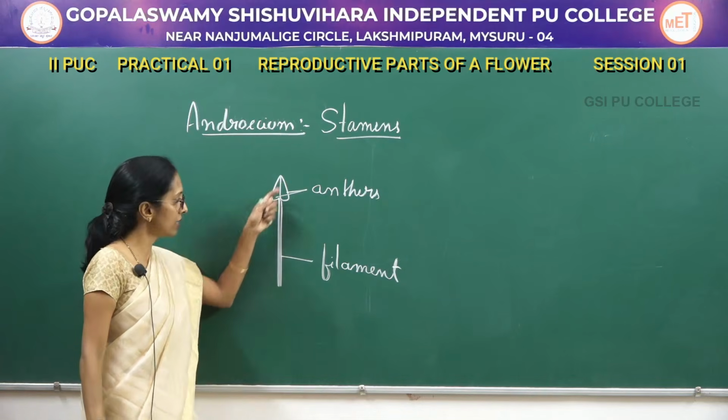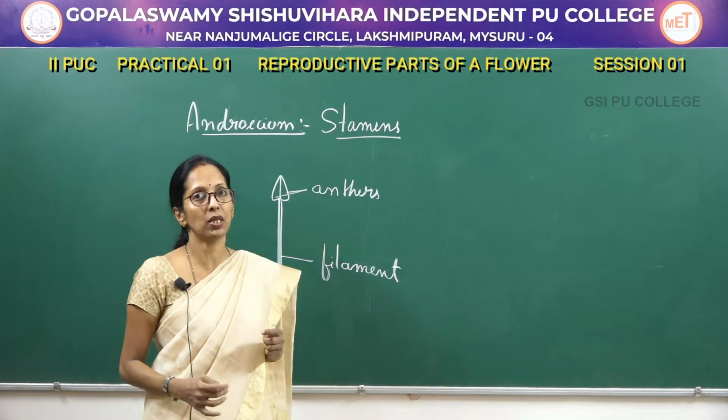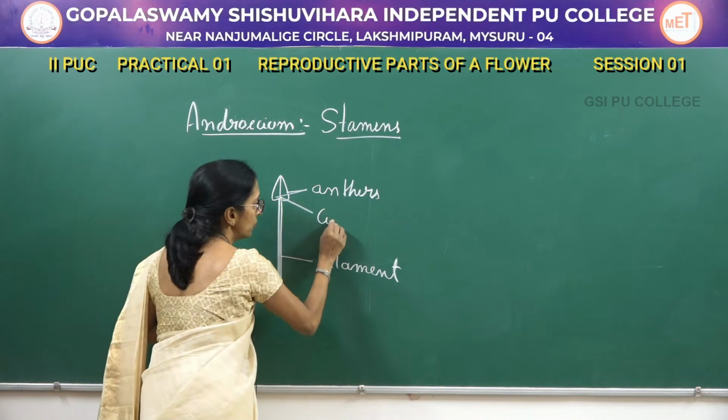Between the anther and the filament there is a tissue that connects these two, which is said to be connective tissue.